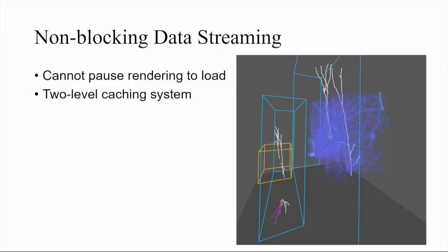And on the GPU side, we take advantage of the sparse 3D texture, which is essentially a form of virtual memory. And so to meet the frame budget and restrict how much work we perform on the rendering thread, we restrict how many pages we actually will upload and display each frame, and we perform the other tasks and uploads asynchronously in the background.